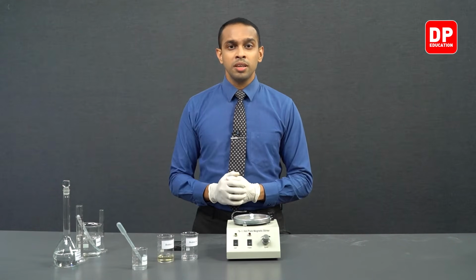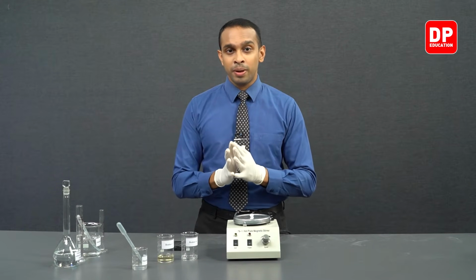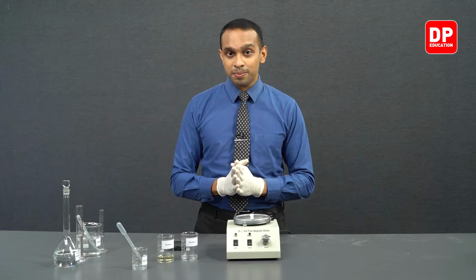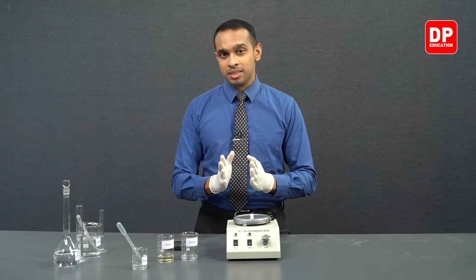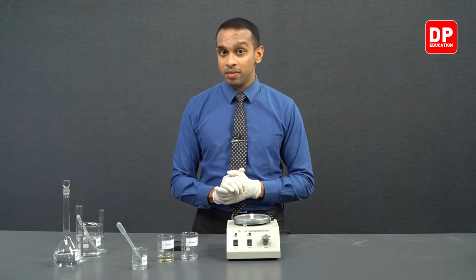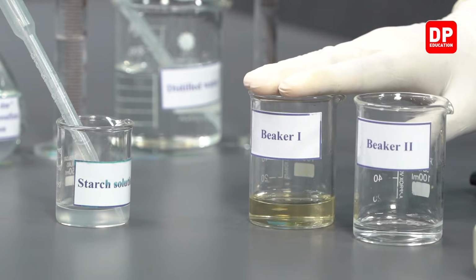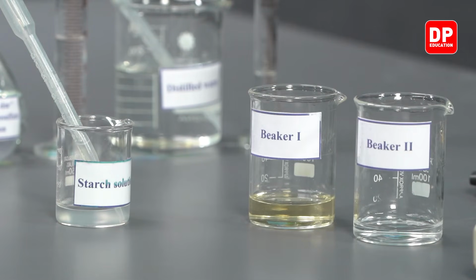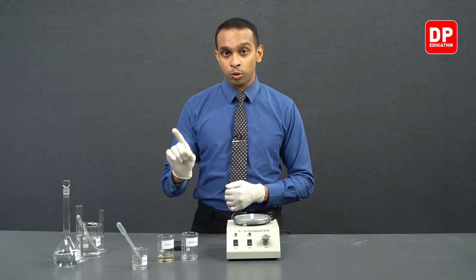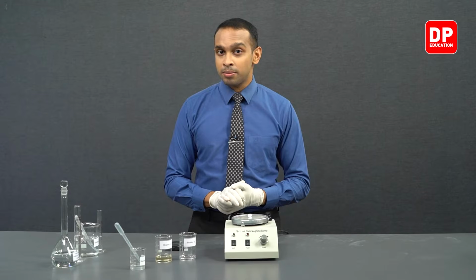And now students, we are going to change the concentration of Fe3+ ions in the medium. So how are we going to do this? The reaction mixture was prepared in the previous reaction by mixing 25 cubic centimeters of Fe3+ ion solution with 15 cubic centimeters of sodium thiosulfate and 10 cubic centimeters of potassium iodide.